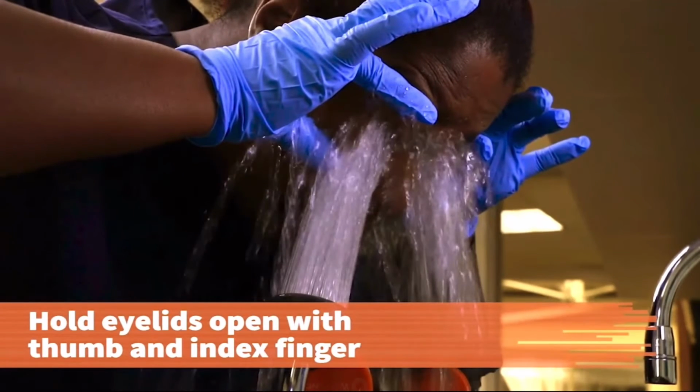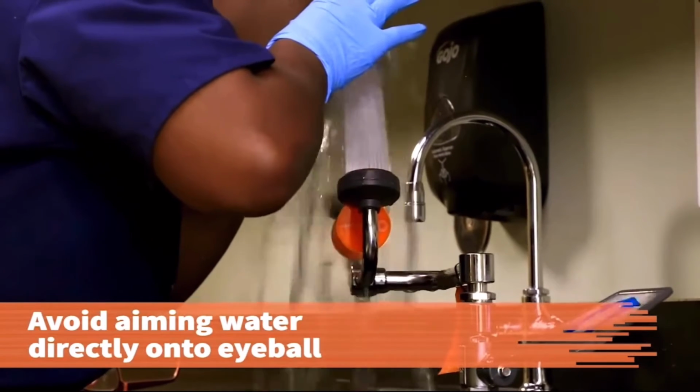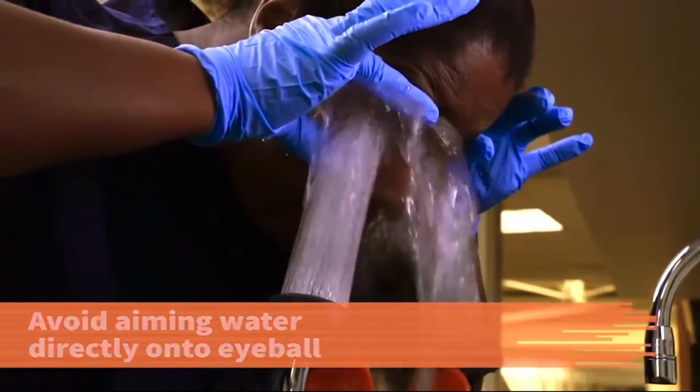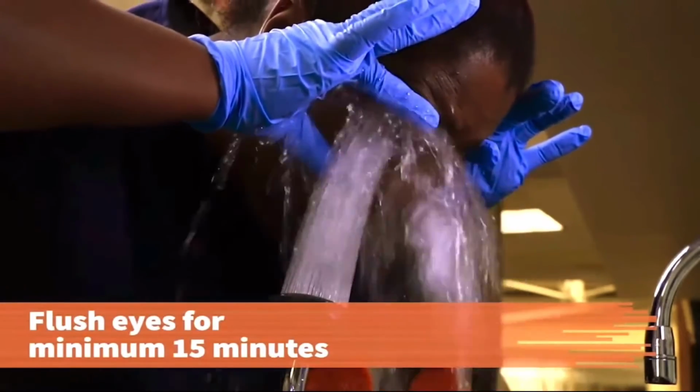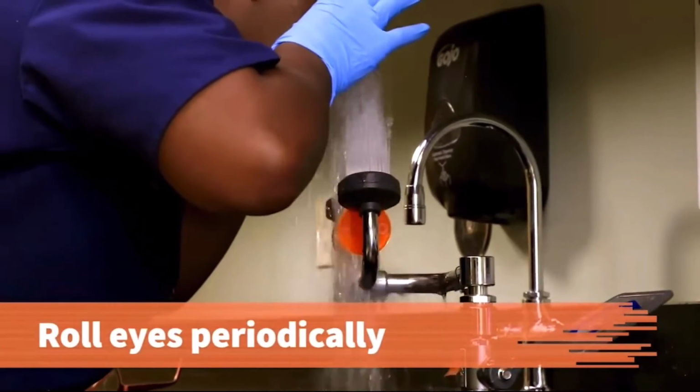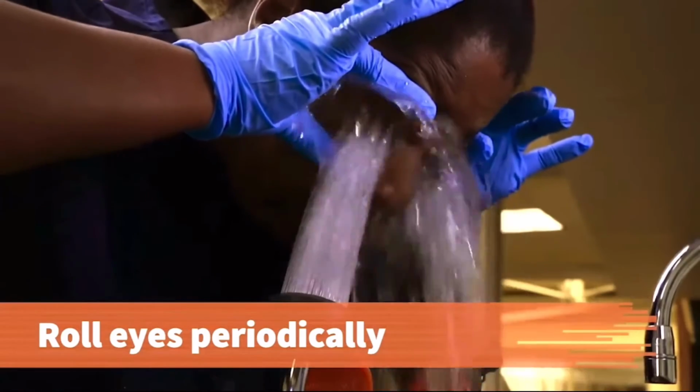The normal reflex is to close your eyes tightly, but to remove all of the contaminated material, you need to hold your eyelids open with your thumb and index finger to ensure adequate rinsing of the entire eye and eyelid surface. Avoid aiming the water stream directly onto the eyeball because it could cause discomfort or damage. Flush your eyes and eyelids for a minimum of 15 minutes, rolling your eyes periodically to ensure complete removal of the foreign and possibly dangerous material.